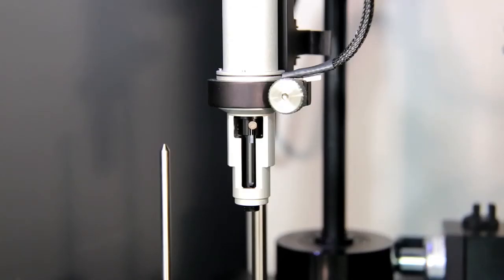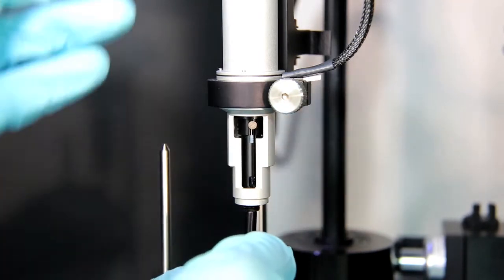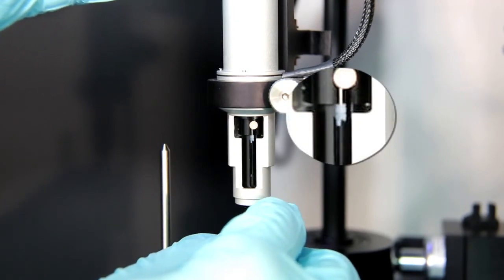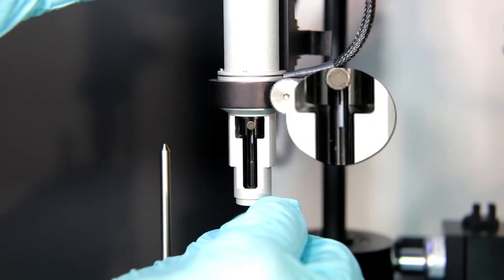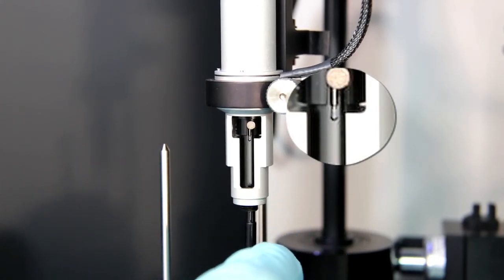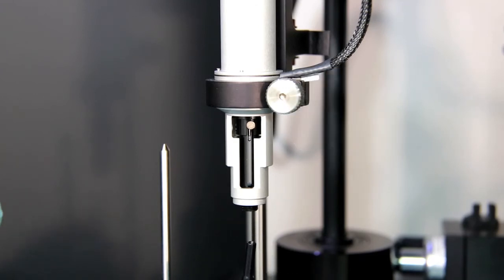To remove the plunger tip, take the tip pulling tool and insert it up into the pipette until you meet some resistance. Its barbed design will slip over the plunger tip and then take the plunger tip with it when removed. Be mindful not to drop anything into the cell when performing this step.